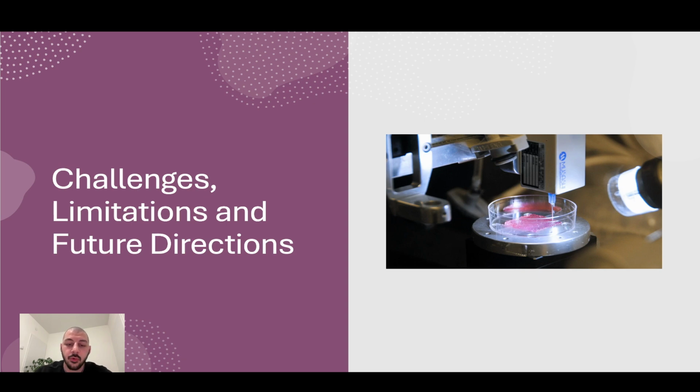In conclusion, the rotary wall vessel bioreactor is a groundbreaking platform for generating physiologically relevant 3D cell cultures. Its ability to mimic microgravity conditions makes it indispensable for applications in tissue engineering, cancer research, and regenerative medicine. While challenges like scalability and standardization remain, ongoing innovations will expand its impact, paving the way for breakthroughs in personalized medicine and therapeutic development.